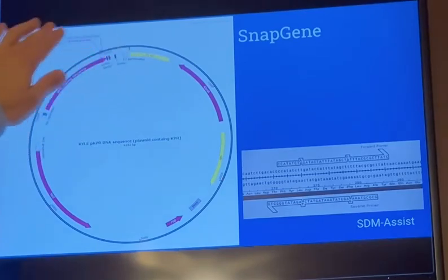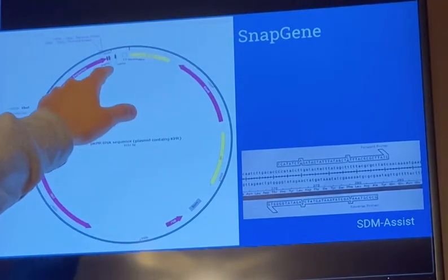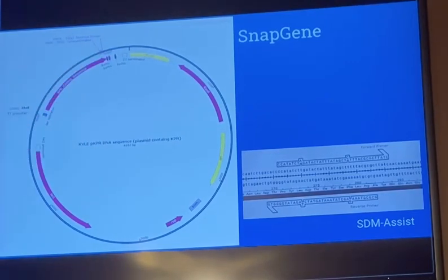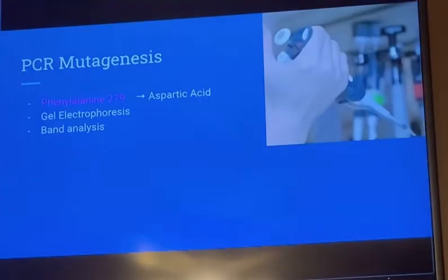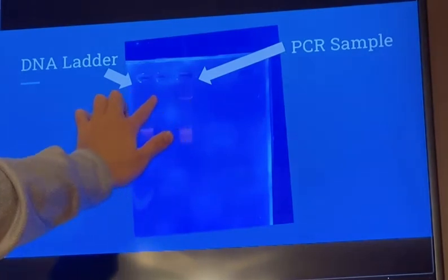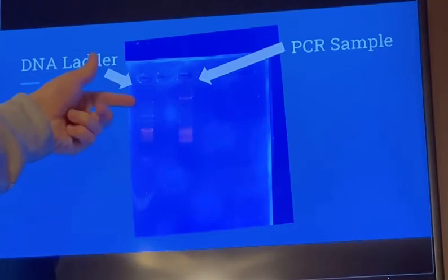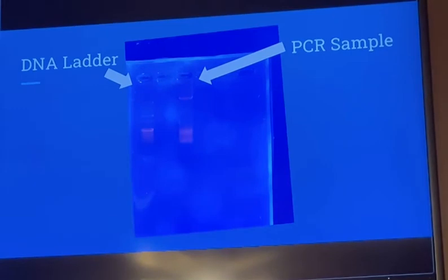This whole thing, we know, is about 6,000 bases. This is how we determine what length we have. If we have that indication of 6,000, which is labeled here, then boom, our plasmid's there. That's the basis of that. We verified that it's there.